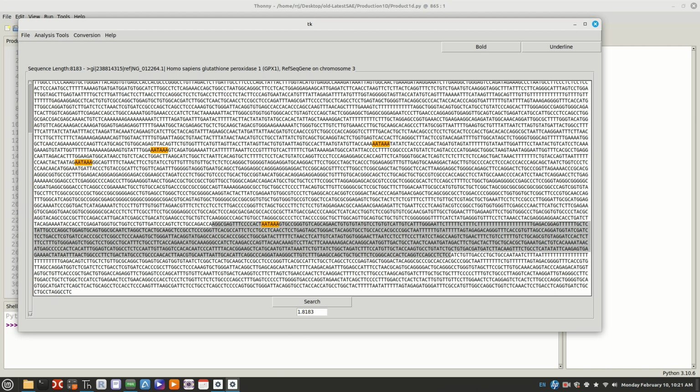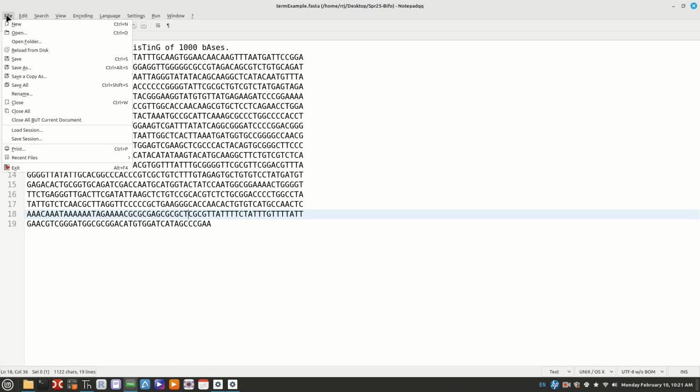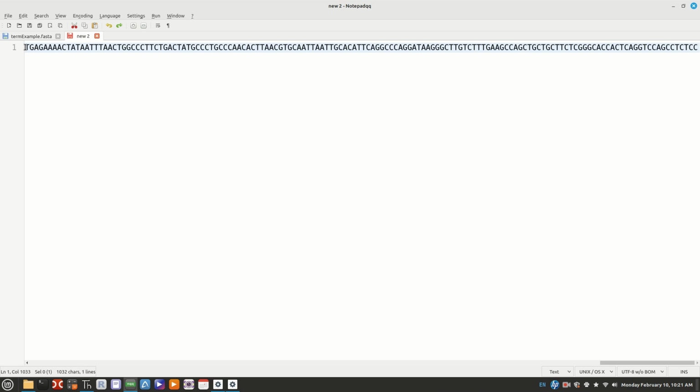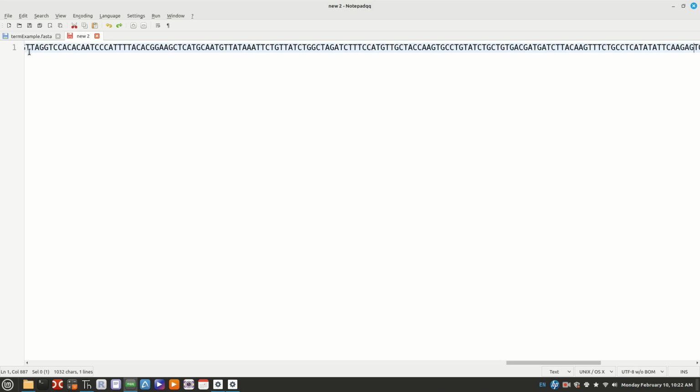In fact, let's do that. I know it's taking up a lot of time, making this a longer video, but I can just go Control V, and most programs will actually read a straight line FASTA.